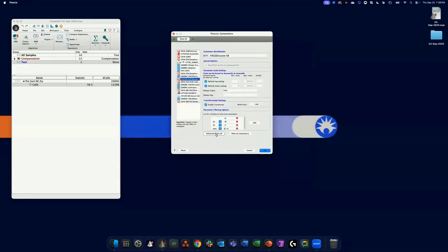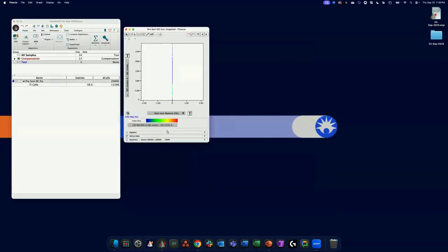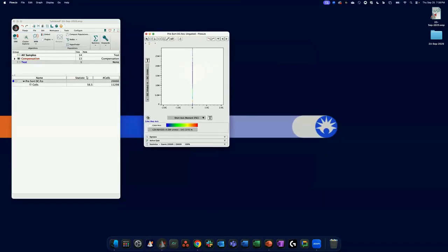You can see there it's telling me how many rules I have applied to this data set. Again, keep in mind this will only apply to new workspaces. So it's worth doing some homework beforehand, before you get too invested in your data, because you'll have to make a new workspace to see the changes. You'll notice my list won't be filtered because I'm still in the same workspace.